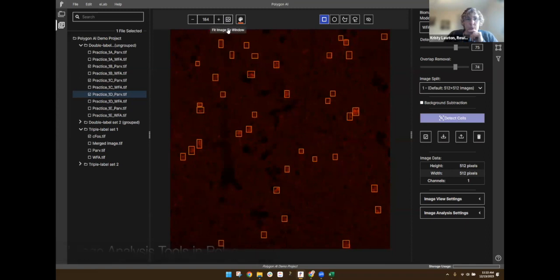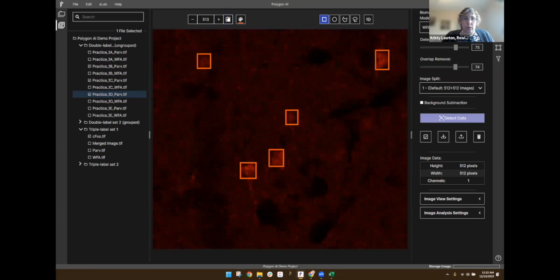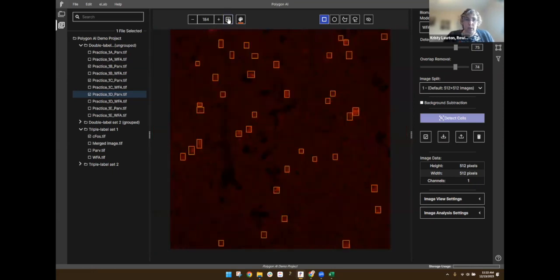Let me just mention some of the controls up here. Zooming, this makes images full size. So if I zoom in to make some corrections, but I want to get back to the full image, you can do that here. You can choose your ROI color here. You can change your shape. So you have rectangle and circle or oval tools, and then also some polygon mask tools. So if you need to draw kind of an irregularly shaped object, you can do that with this tool.